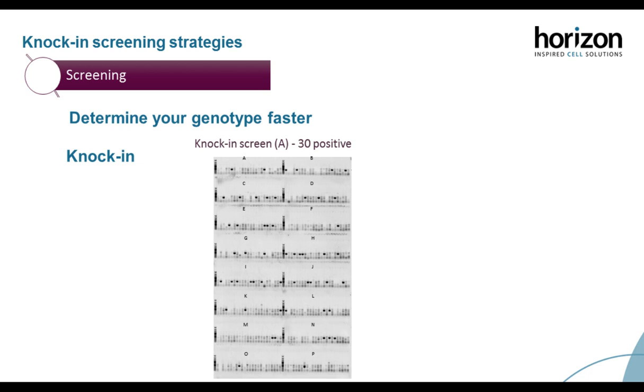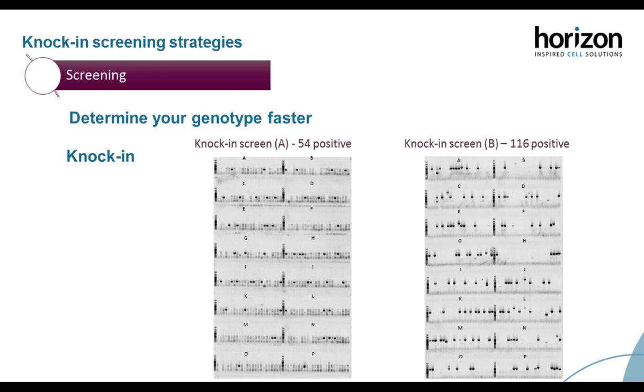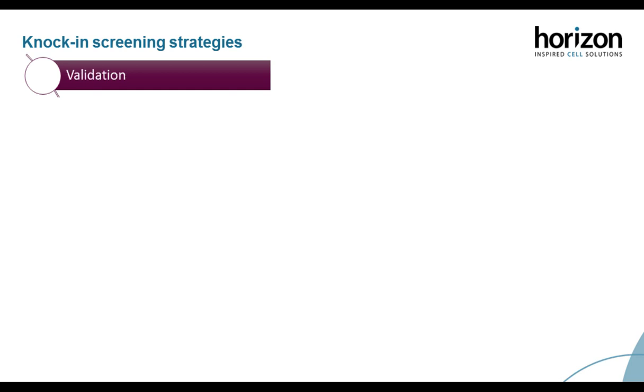So to confirm the clonality of your cell, in cell engineering we use imaging software, which can be seen on the right here. We can scan all the wells that we've done a limiting dilution in on day 0, and then look at them maybe 10 days after, or whenever the cells have grown out, to see if they're clonal or not. If you don't have this imaging software, you can also perform single-cell PCRs, or you can perform some TOPO cloning to make sure you're getting a good idea of what different alleles are present in your DNA mix, in your clonal population. So if there is a contaminant of wild-type cells in your clonal population.